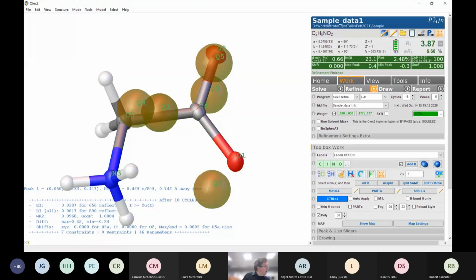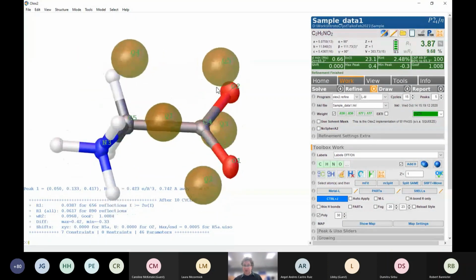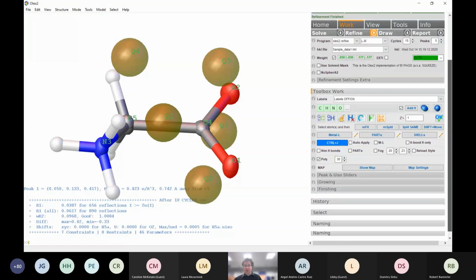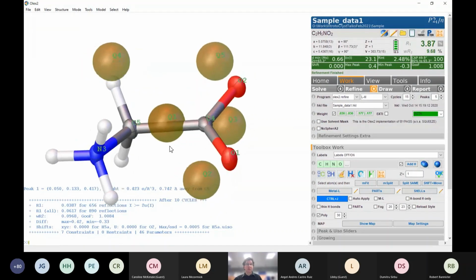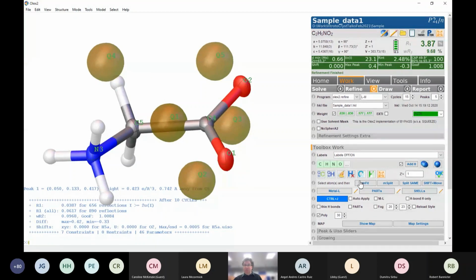So that CIF file does need to be curated as well. So there's information and so on. But before we get to that, let's do, so yeah, what I'm going to do first. As I say, we've been in refine the whole time. Check, everything else looks good, and I'm quite happy with things. So we can go through the details.